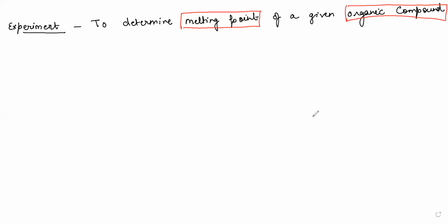Hi everyone. So today we are going to talk about the characterization and purification of the chemical substance that we are having. This time we will be taking an organic compound which is in solid state. A small powder-like form we will be having, so that we have to determine. Now how we are going to determine the compound is by the melting point.